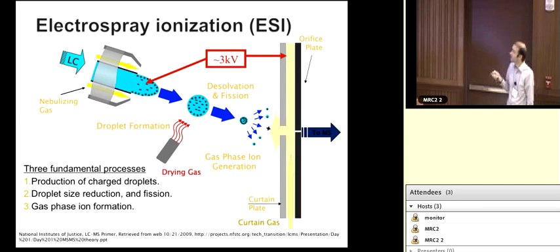So mass spec detects any compound that can form an ion. If it can't be ionized, it's not going to work by mass spec. And there are relatively few metabolites that fit that criteria entirely. There are usually tricks that we can play for something that's resistant to ionization to get it to ionize, and we can talk about that if there's interest.